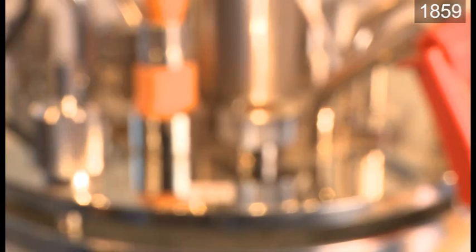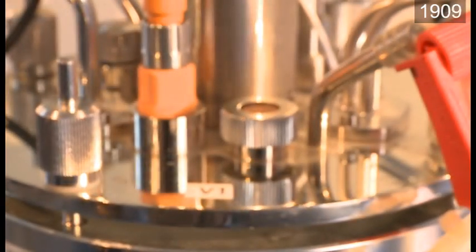We have a number of these fermenters and they're all identical so that we can actually change conditions in each of the fermenters, so that we can shorten the timeline of development by using a multiple fermenter bank.